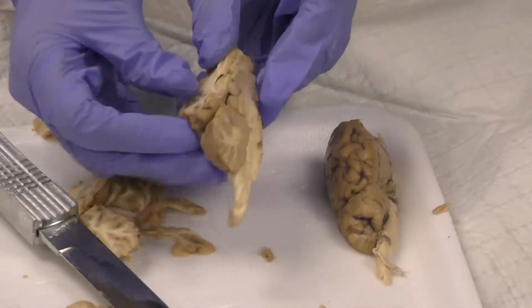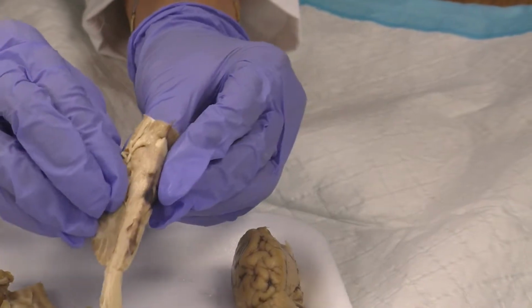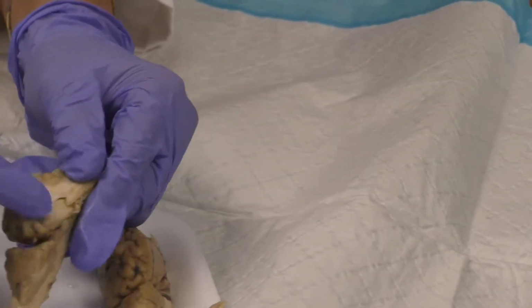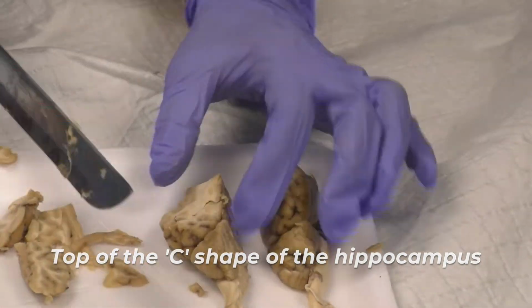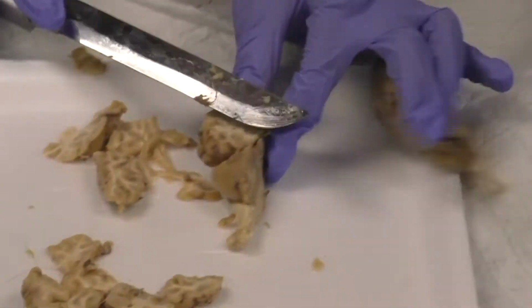Oh, see that? I hit it. And so that's the top of the C. There's a C, and what we're looking at right there is the top of the C. So I'm going to follow the C all the way down.